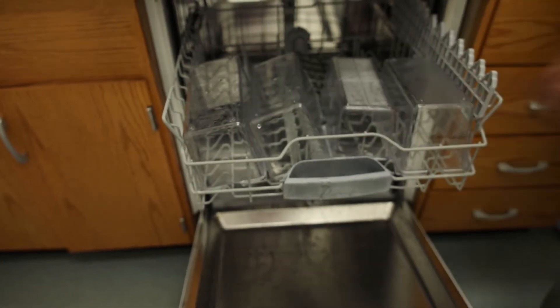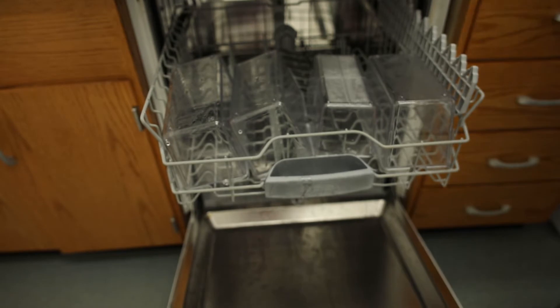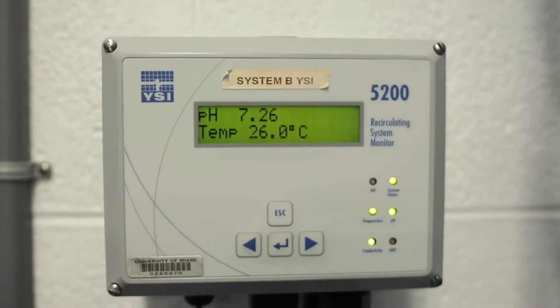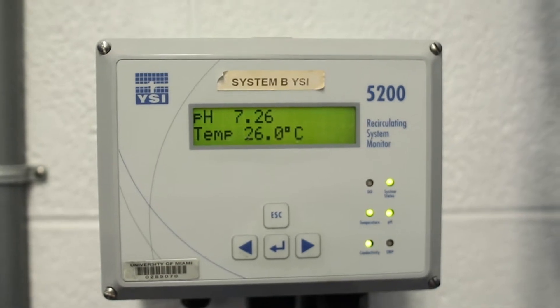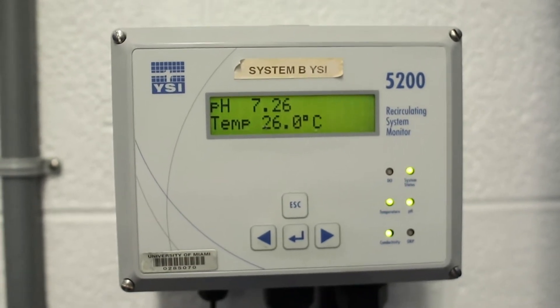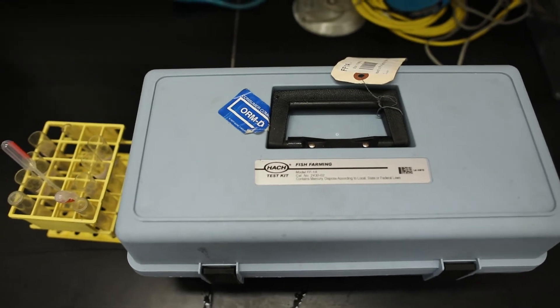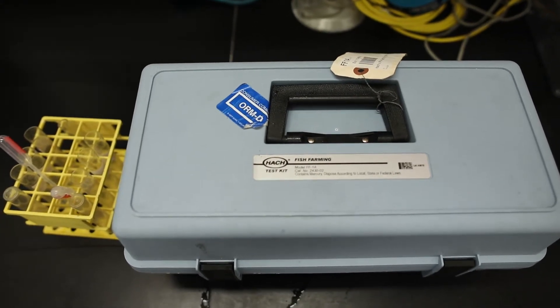Soon we are going to introduce rotifers as a new diet for the babies. All the used tanks, nets, and dividers are placed in a dishwasher to be cleaned with hot water and bleach. The water quality levels, such as pH, alkalinity, ammonia, and nitrate, are tested manually weekly with a Hach test kit and the values are reported in the system maintenance log.